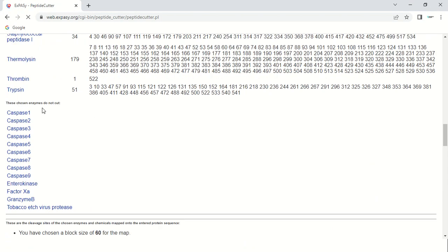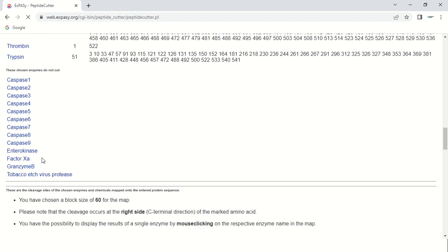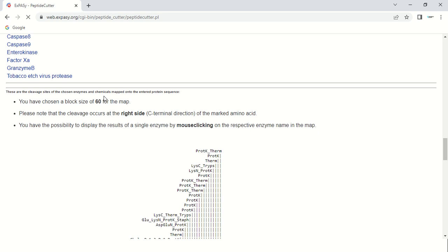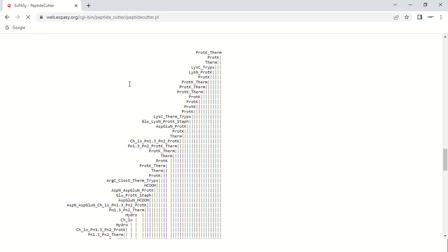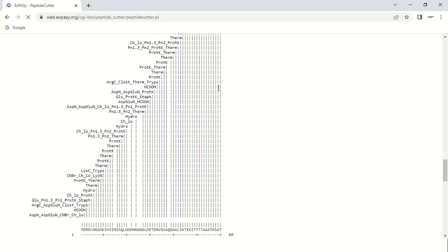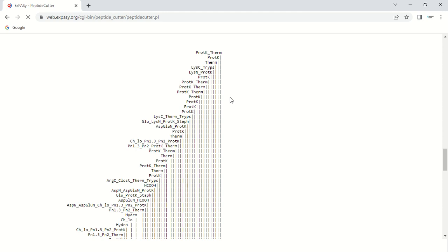In this section, these are the enzymes which do not have any cleavage site in the sequence we provided — for example, Caspases 1, 2, and 3 do not have any cutting site in our sequence. Scrolling down again, there is a graphical summary showing the cleavage sites of all enzymes. These are the enzyme names and their corresponding cutting sites. If you want to know about a particular enzyme, just place your cursor on the enzyme name and click.